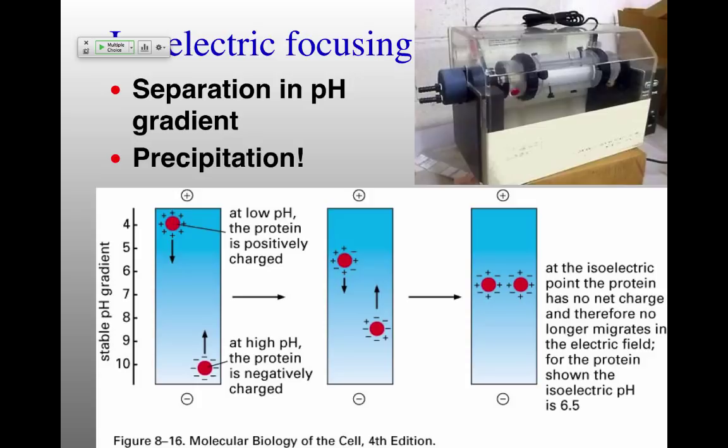What are those main charged amino acids? So these are going to be your acidic and basic side chains. So aspartic acid, glutamic acid, lysines and arginines. And those are going to be differentially displayed on the outside of your protein, which will give it a different charge. This is how ion exchange chromatography works. Again, you've got different charges.